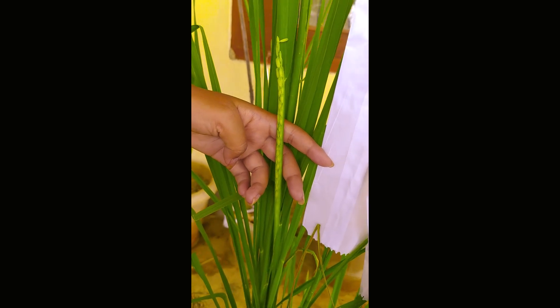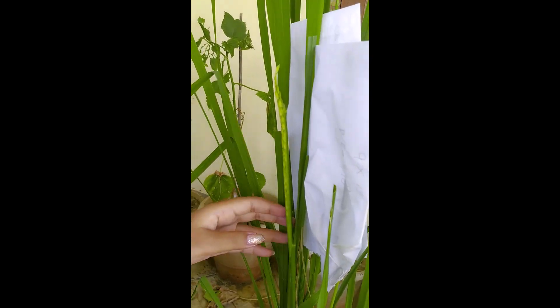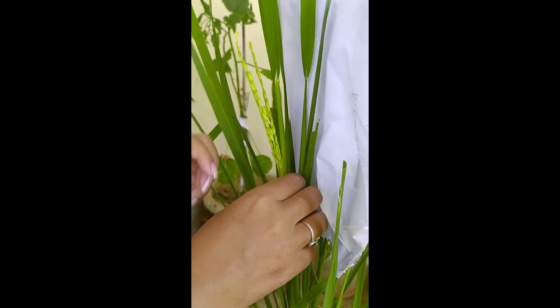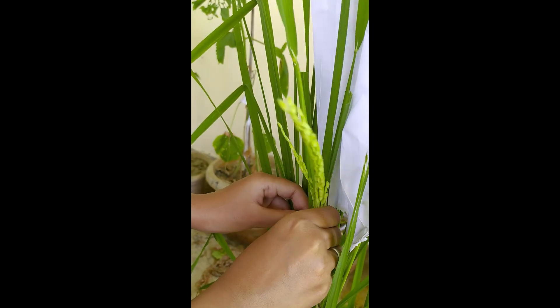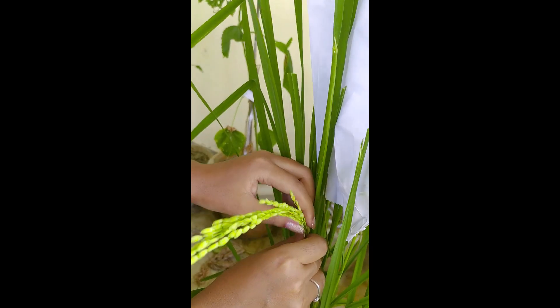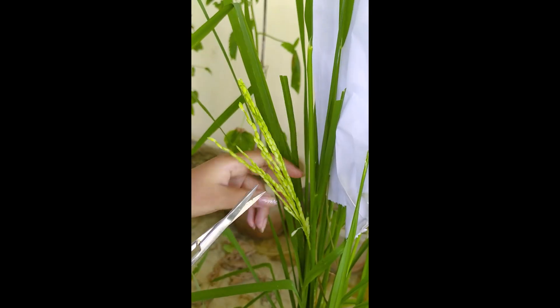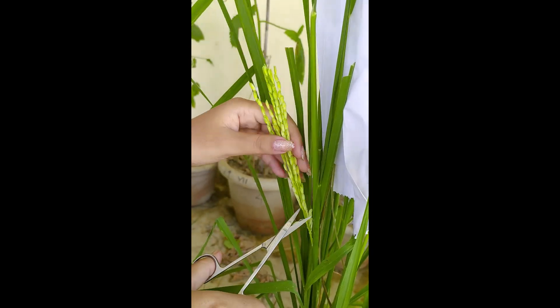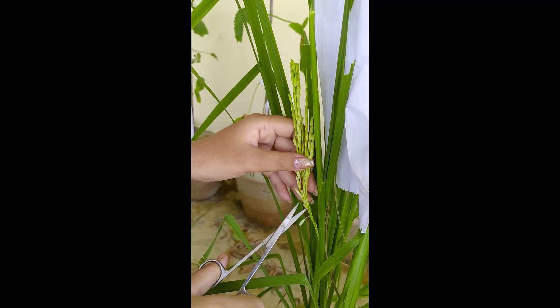After choosing the male and female parents, in the female parent, the first step is to select the right stage of panicle, which is when one-third of the panicle has emerged. After selecting the panicle, we carefully peel off the enclosed panicle from the leaf sheath. Next, we remove the top one-third portion of the panicle, as anthesis always begins from top to bottom. Similarly, the bottom one-third of spikelets are removed as they are considered very immature. Now only the middle spikelets remain, and we proceed to cut the lemma and palea by 20% below the tip.